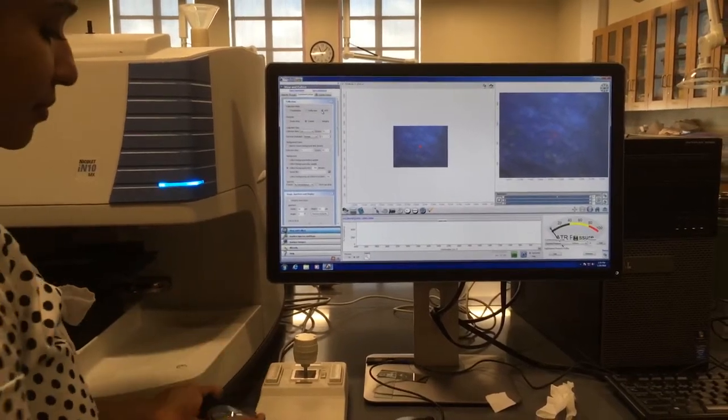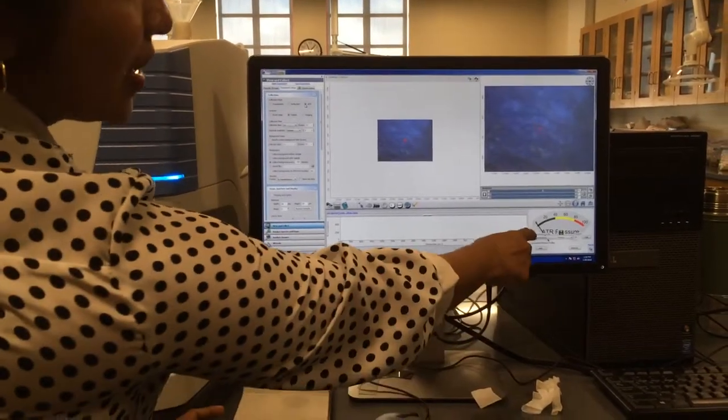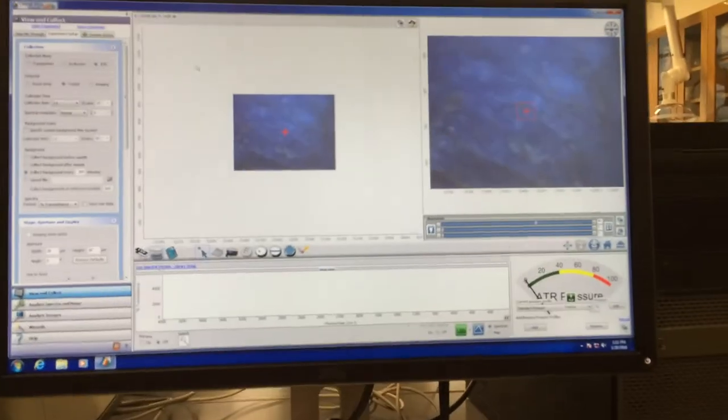And so you can see, it will apply a pressure. The ATR is going to apply a pressure and everything and set it up.